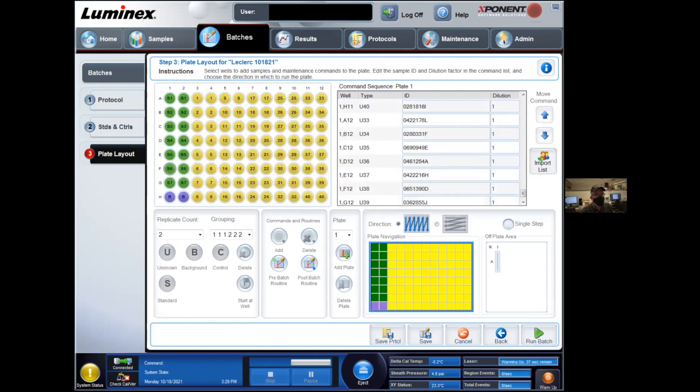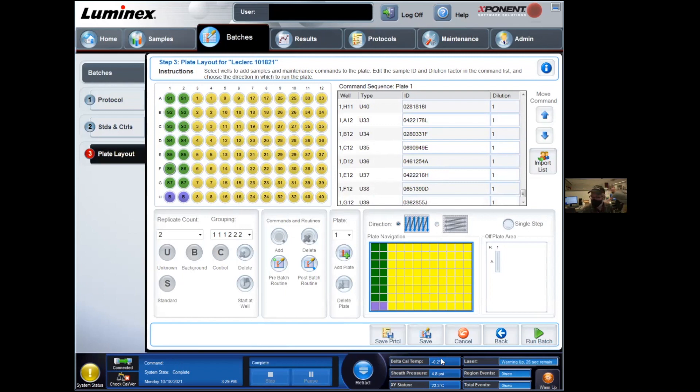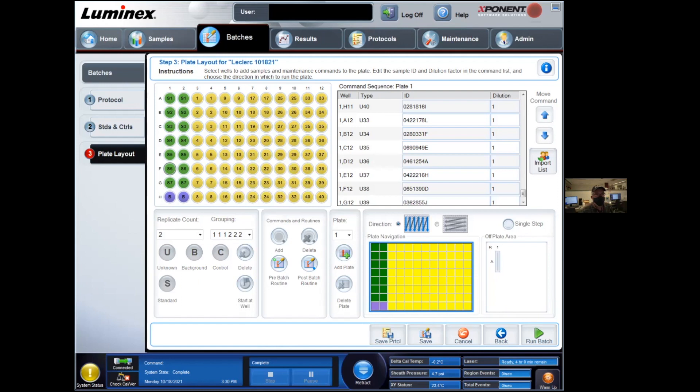So at this point, you're ready to run your plate. Click the eject button to open the robotic arm that will move your plate around. Load your plate and simply click on the run batch. So typically, a plate should take 45 minutes to read.